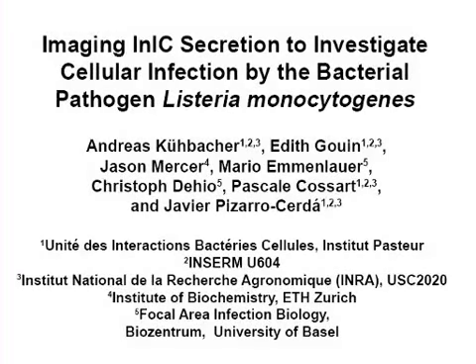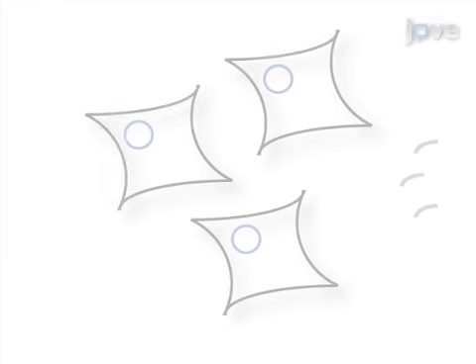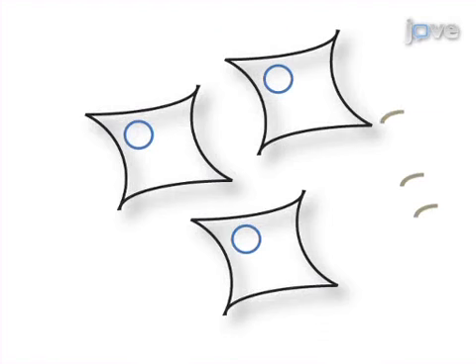The overall goal of the following experiment is to quantify cellular invasion by the pathogen Listeria monocytogenes within the context of siRNA assays to discover novel cell functions required for bacterial infection. This is achieved by initially performing a cellular siRNA reverse transfection to inactivate specific host cell functions. As a second step, cells are inoculated with Listeria monocytogenes, which will differentially infect cells according to the cellular functions that have been affected by the siRNA treatment.